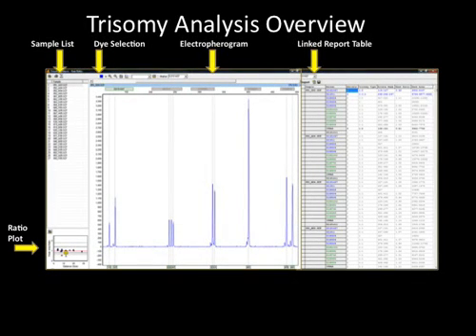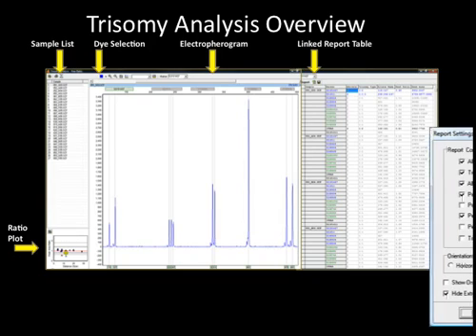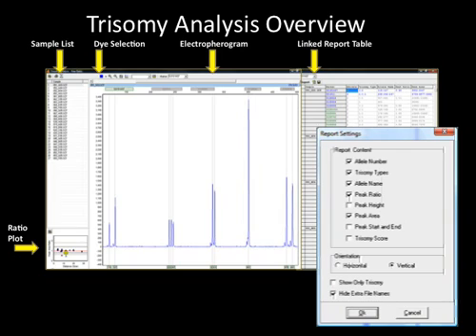The trisomy analysis screen contains a sample list, icons similar to those in the main analysis screen, a linked report table, and linked ratio plots. To customize the report table, select the report sheet icon to activate the report settings selection.